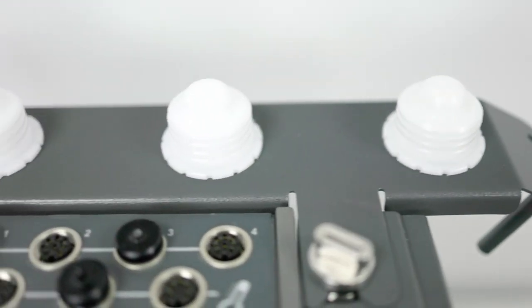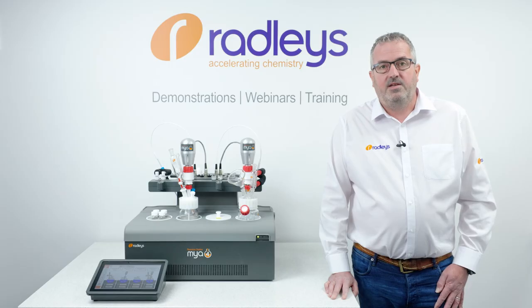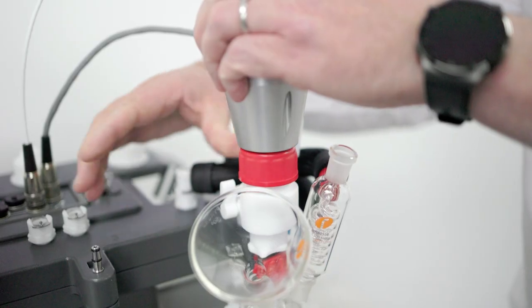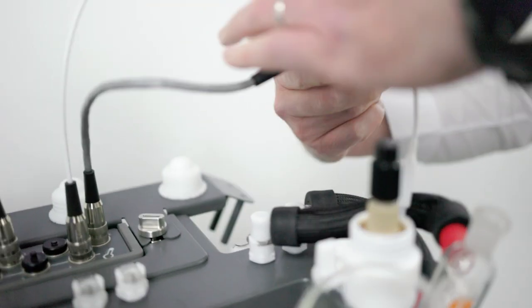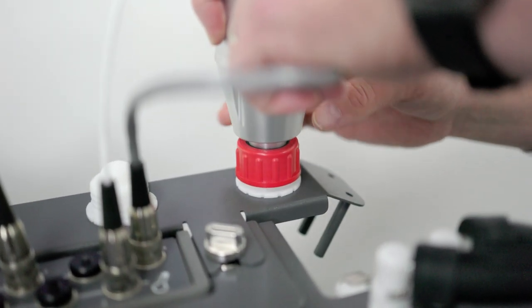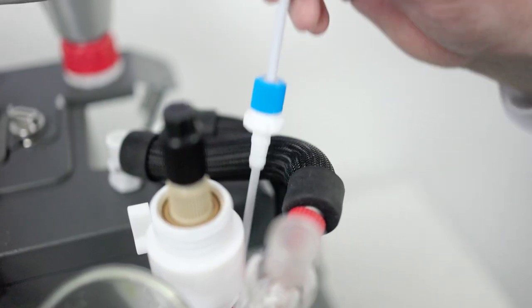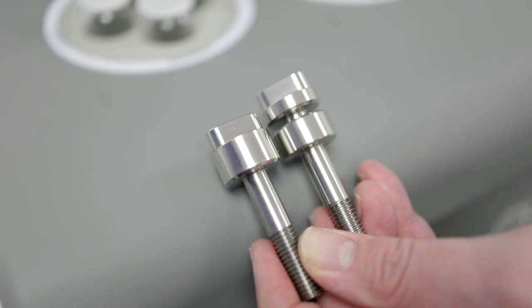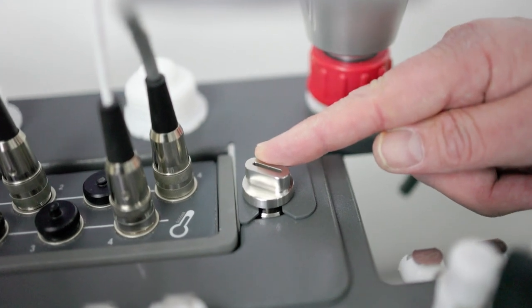Another new accessory is the compact stirrer and probe holder. Rather than leaving your compact stirrers out, leaving them open to possible attack by chemical vapors or possible strain on the cable, this organizer shelf has mountings for the compact stirrers and storage positions for the temperature probes, making the Maya 4 ready to go for the next user. The new holder does require new bolts to attach it to the head that's being used.